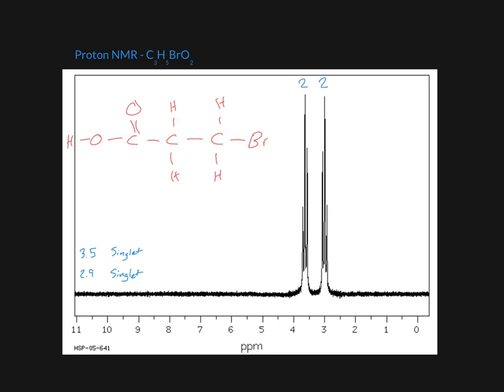So we also will negate the hydrogen that is bonded to the oxygen from the carboxylic acid. It does not count towards one of the 2 groups. So we will look here as well as look here and call these our 2 groups for proton NMR.